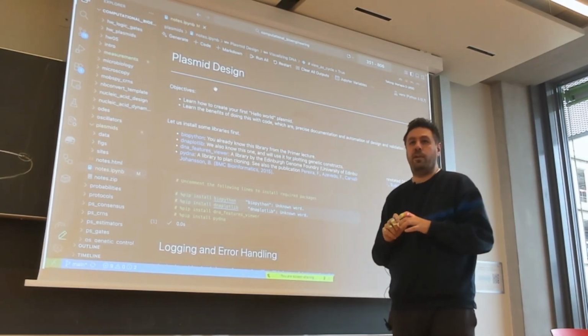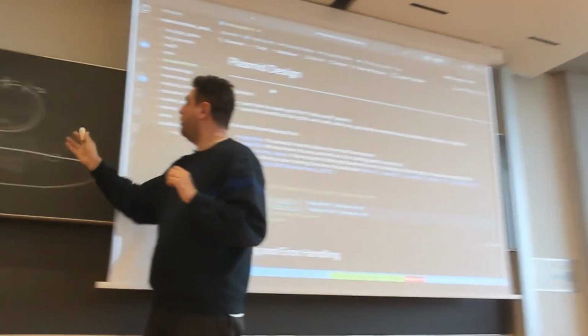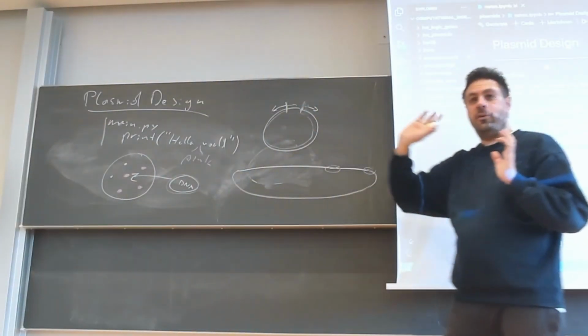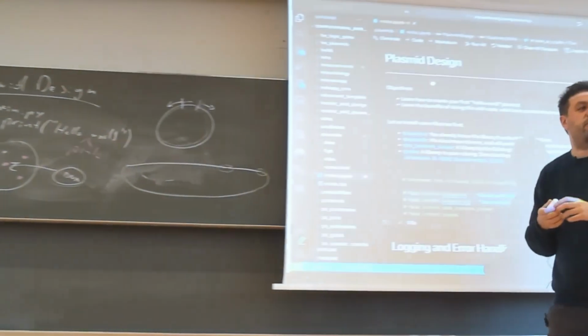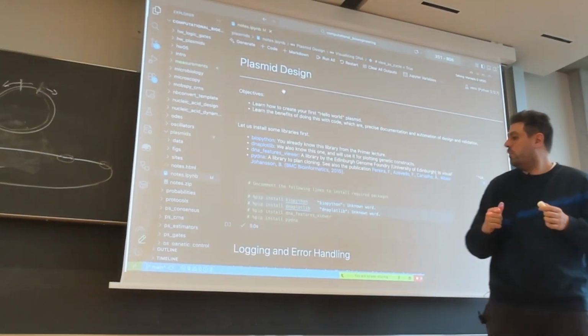So this will be very nice because this is kind of the verification that I wrote here. Like you will design the backbone, you will design the insert, and then you can simulate with pydna whether this really works in a correct Gibson assembly. That's a pretty nice tool.